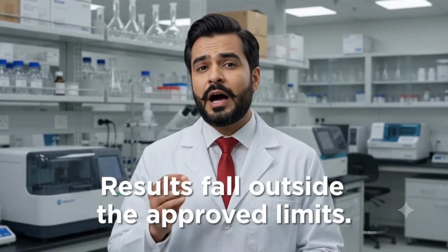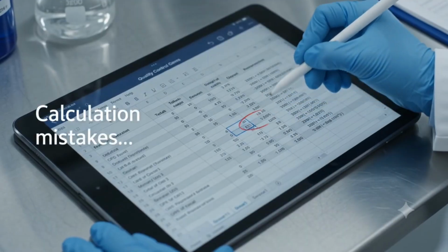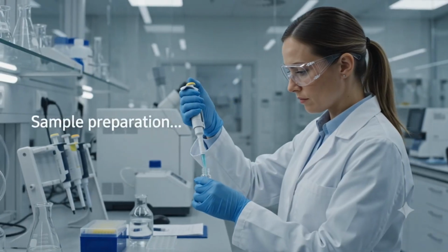Sometimes, results fall outside the approved limits. These are called out-of-specification, or OOS. The QC laboratory investigates analyst errors, calculation mistakes, instrument problems, reagent quality, sample preparation, and environmental conditions. If necessary, testing may be repeated according to approved procedures. Every investigation must be scientifically justified and fully documented.